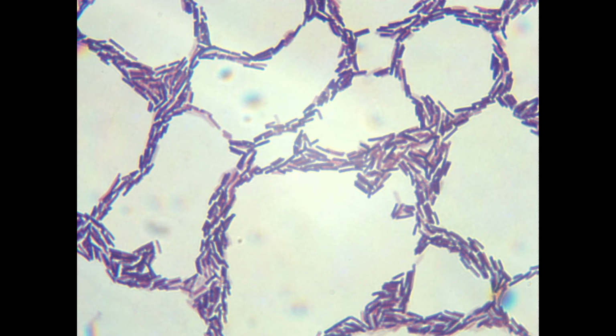Now we can look at some examples of the kind of things that you might see down the microscope when you're looking at your gram stain bacteria. So in this first image we have Bacillus subtilis. So this is a gram-positive organism, as we can tell from the purple staining, but we can also look at the shape and we can see it's a rod-shaped bacteria.